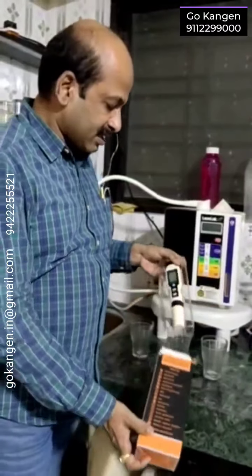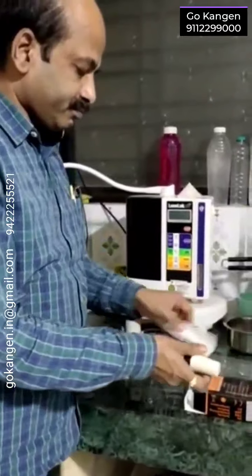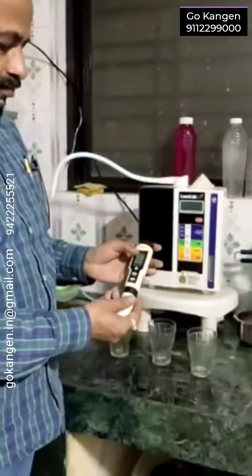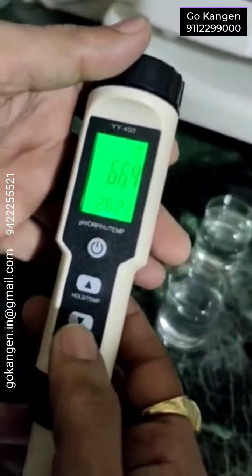The packing is like this. Power on. Let's check this meter now.